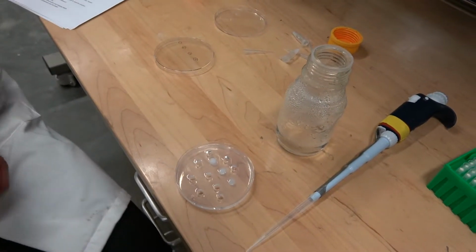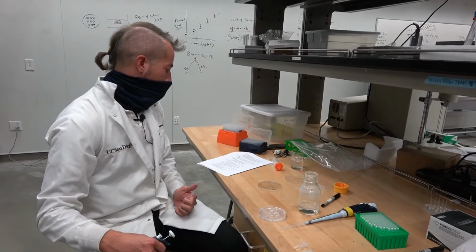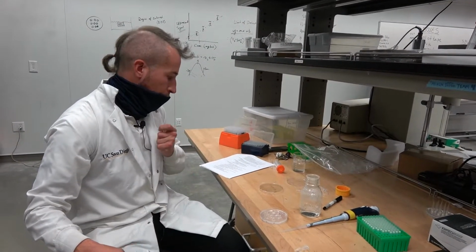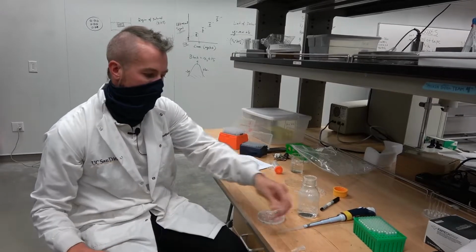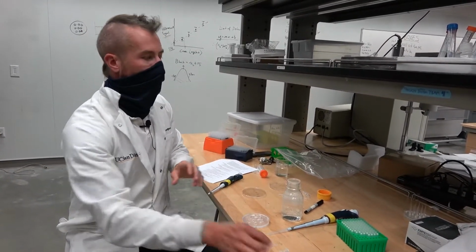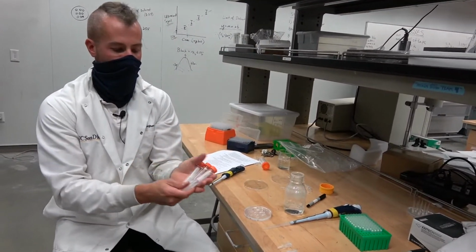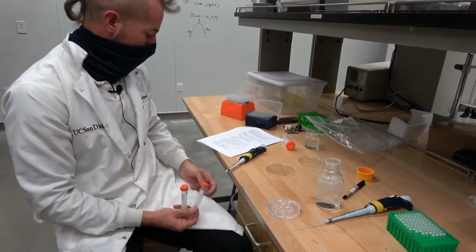And so what I'm going to do is just continue to follow the instructions here on part 10 of your protocol to add the rest of my different concentrations. In addition, I'm also going to add samples of my 3 different sizes. Remember these?